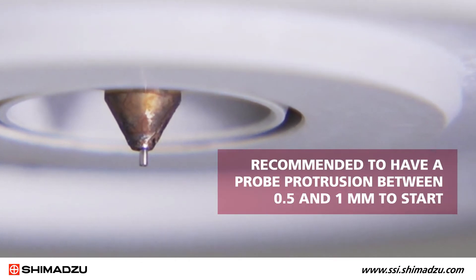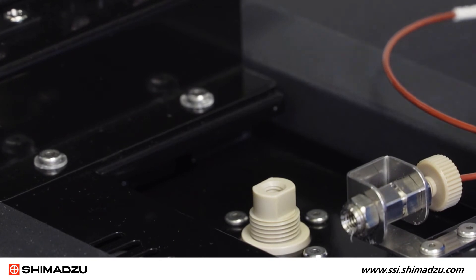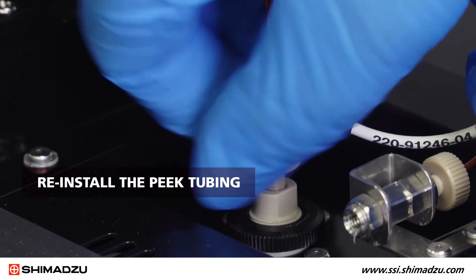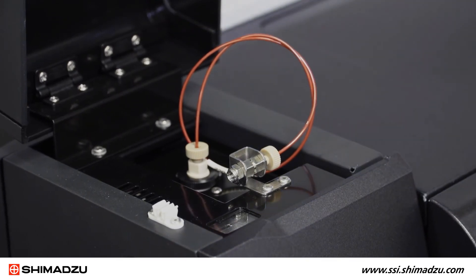It is a general recommendation to have a probe protrusion between 0.5 and 1 millimeter to start. Once you set the probe protrusion as desired, you can secure the assembly in place with a locking nut. Then reinstall the PEEK tubing in the source inlet. Now you are ready to run with a new capillary installed.